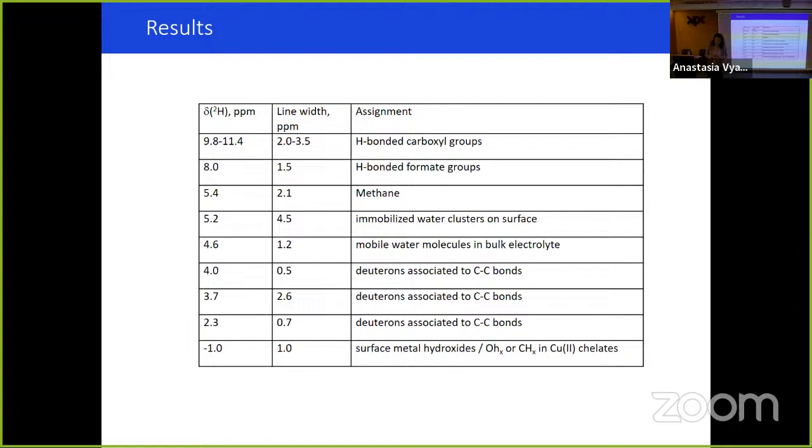I have a couple of questions. So, your first part of the talk, the solid state NMR, of course, you use those materials because they have all these convenient nuclei, phosphorus, fluorine, proton, and so on and so forth. Can you do it on other types of materials? Minerals, for example, where you have metals, quadrupolar nuclei, and things like that.